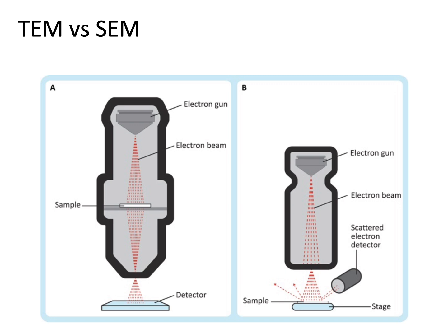And when I first was doing this microscopy back in the early 2000s at UMass, there were these electron microscopes in the basement of the science building there. There are these old workhorses from like the 1960s and 70s. These microscopes were very, very mechanical, so there wasn't a lot in the way of electronics or computers. So it's almost like a 1950s Ford or something like that. All the pieces were very apparent and clear. And the electrons would actually go through, and the detector was photographic film that I would put under there.